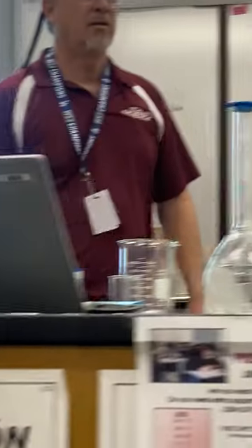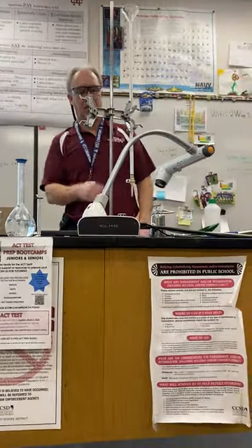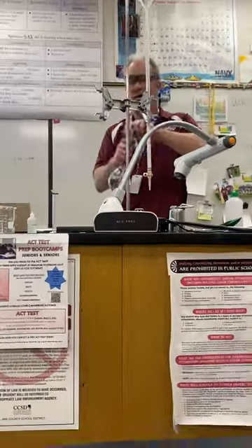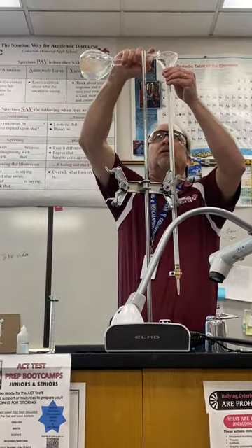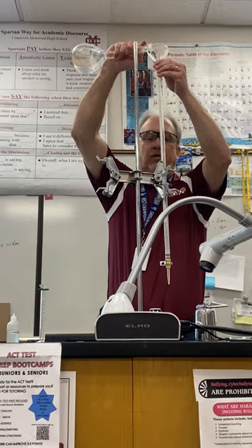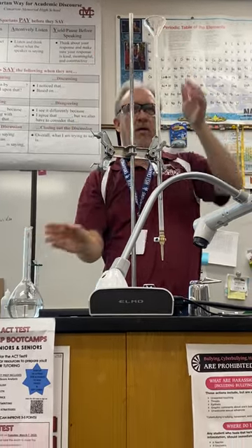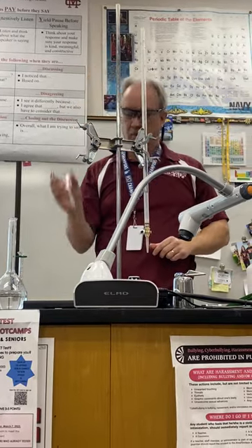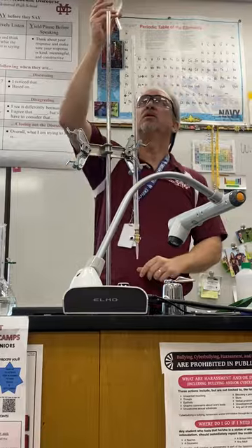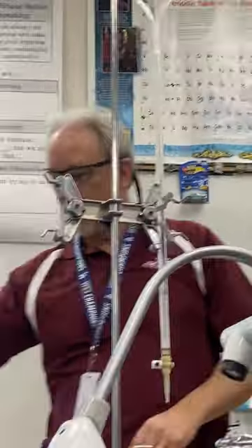Okay. So now that I know that it's an acid, I'm going to want to put a base in my clean burette. So I find a strong base, like sodium hydroxide, I'll have that available for you. And I'll pour it in there. I don't have to spend an hour getting it right at zero. It doesn't matter. Whatever it is, where it is. I'm just going to leave this up here for now. I don't feel like having a mess. So, take my waste beaker now.